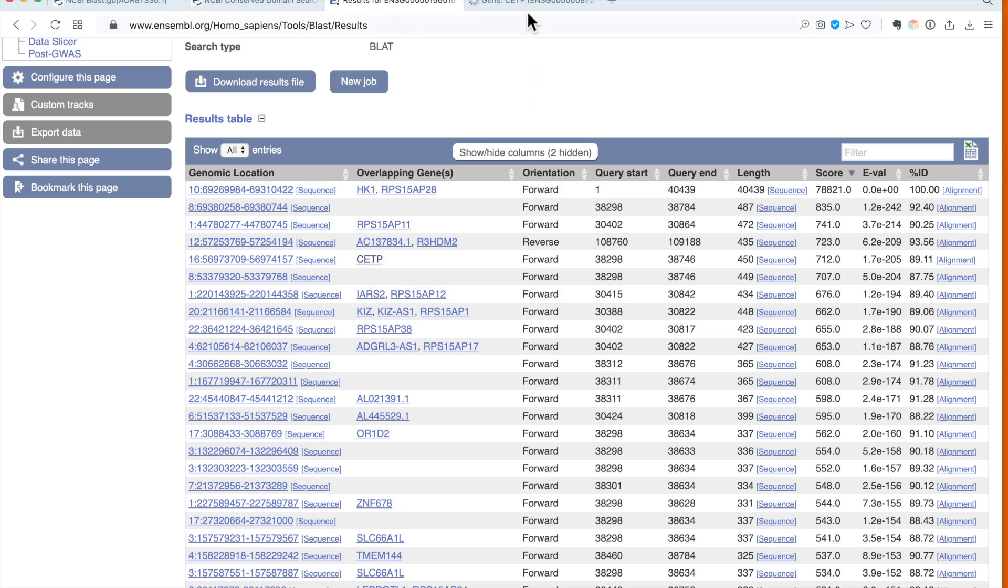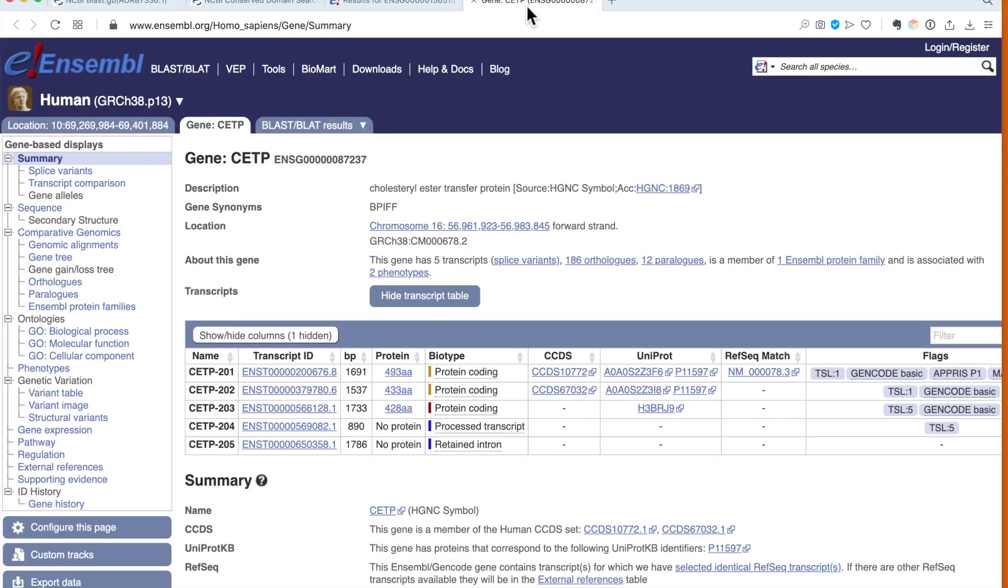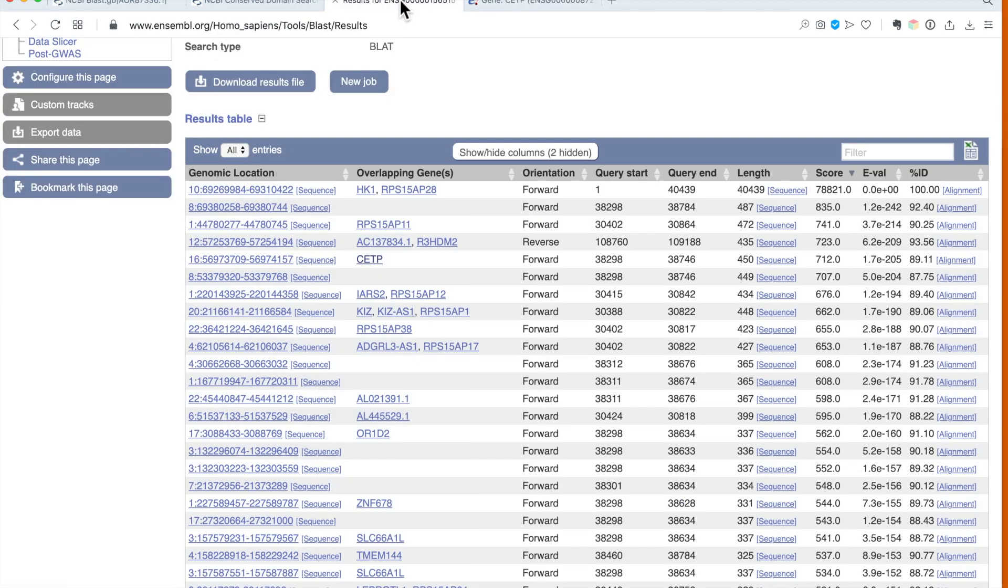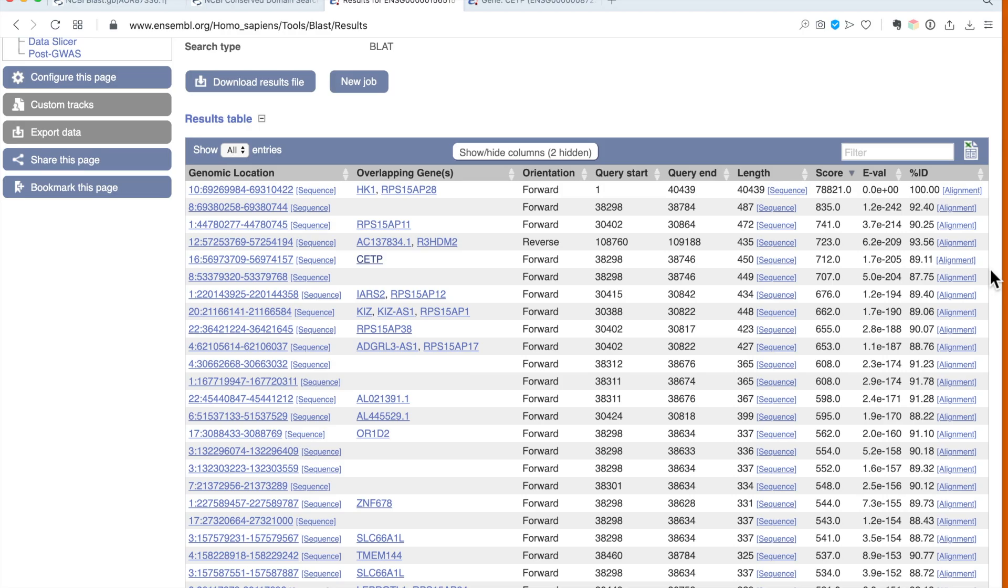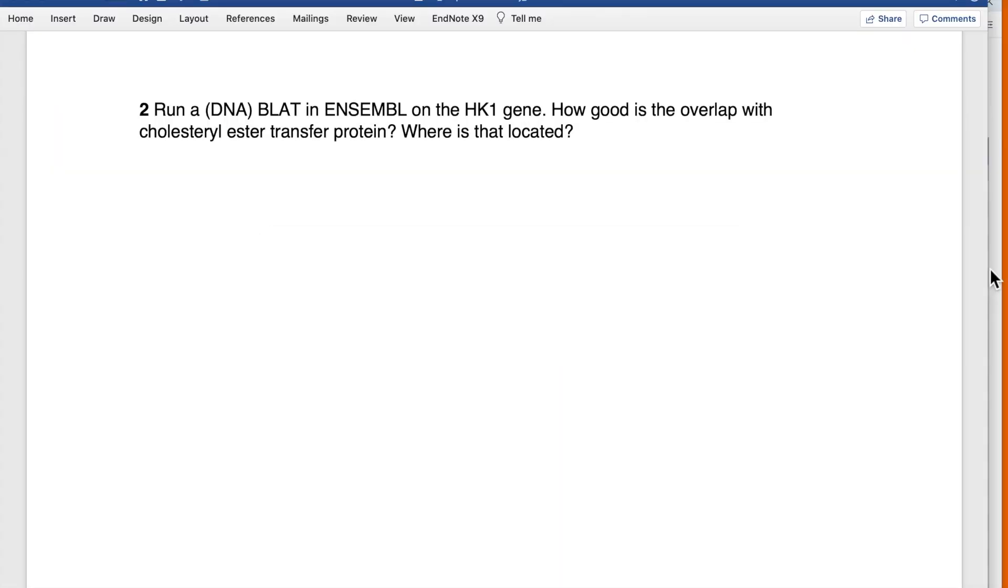If we open the result, it's cholesterol ester transfer protein, so it's the one that we are looking for. If we scroll to the right, we can see the percent overlap is 89.11 percent, so 89 is our result.